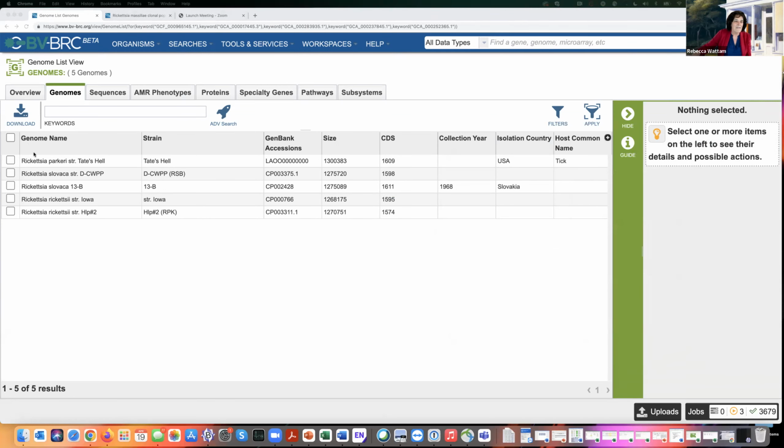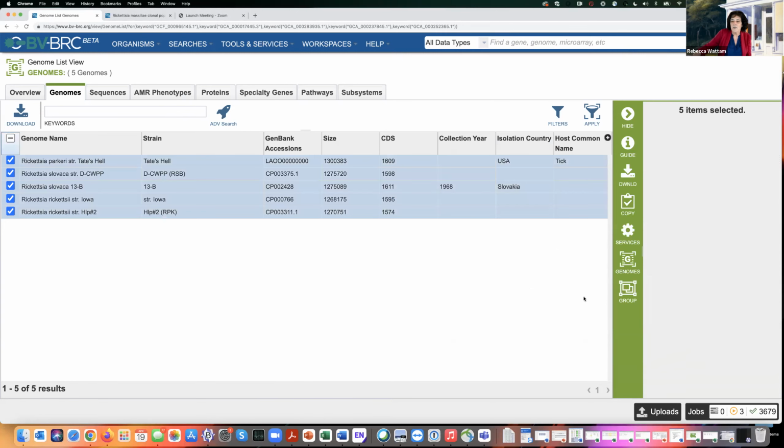And then once I have this, I can click on this and I can create a genome group. Now it's not so hard when there are just a short number of genomes. But when you have like 100 genomes, you don't want to enter them individually into the service. It's like the person who had 192 paired read files that they want to enter for an assembly.